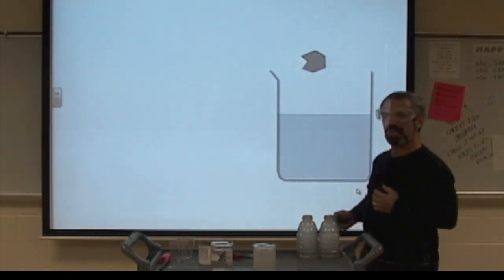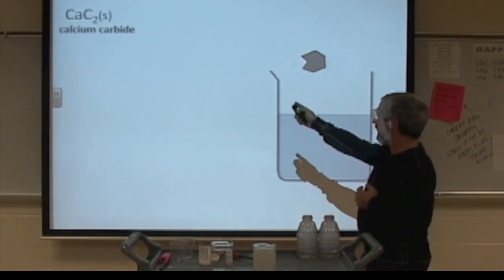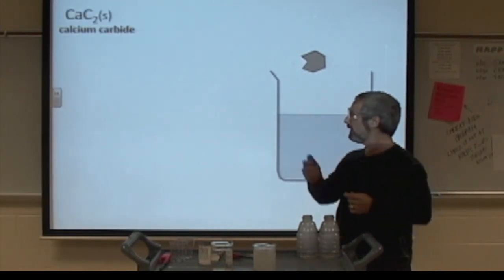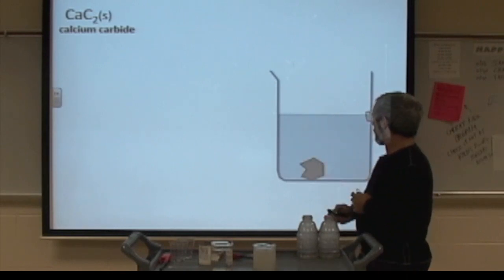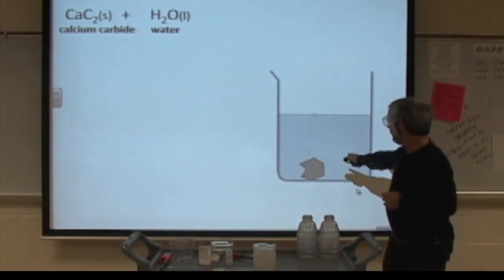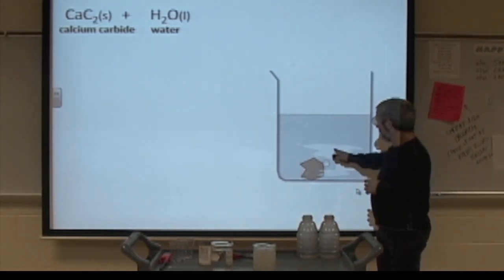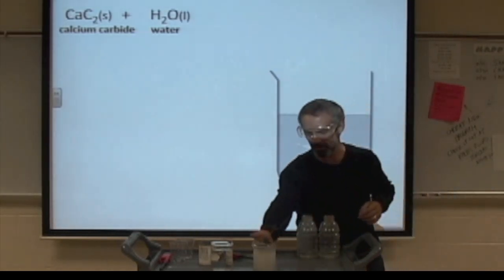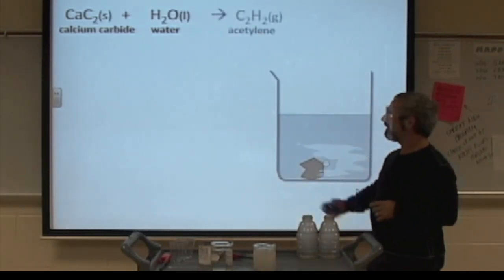Well, the piece of calcium carbide, and that formula CaC2, is reacting with the water, good old H2O liquid, and we're seeing bubbles and also a cloudiness you see right here. The beaker's gone cloudy.